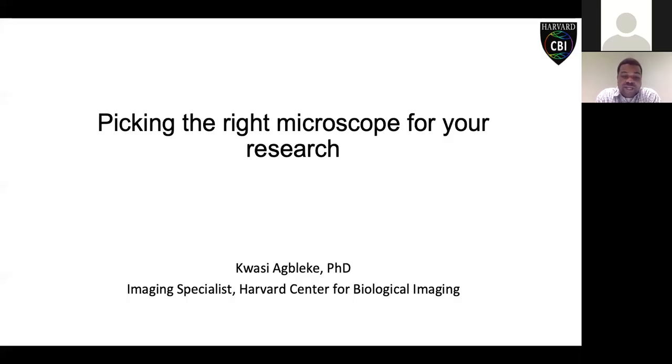So hi everyone, I'm Kwasi, and today I'm going to introduce you to the various microscopes at the Harvard Center for Biological Imaging and what applications you can use them for in your research. I'm going to briefly give you an overview about the various techniques, how they are used, and what microscopes we have in the facility that apply those techniques, and then give you a guide that will help you pick the right microscope at the center.